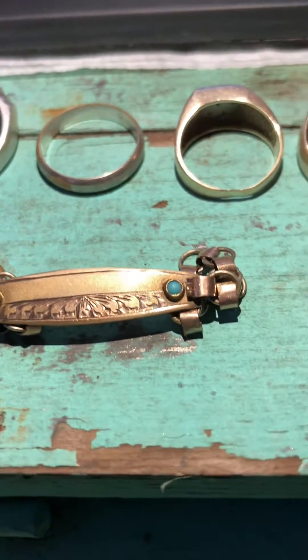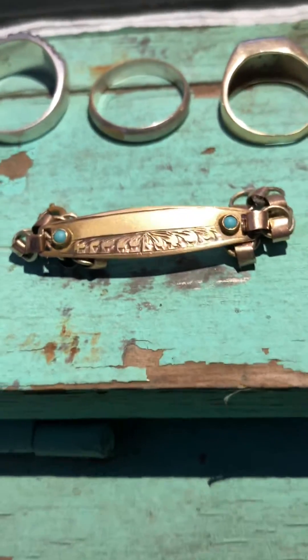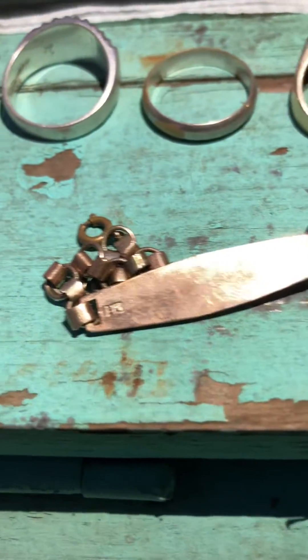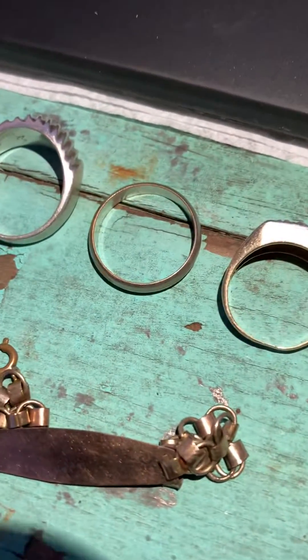We have 8 carat rose gold compared to all these other metals — this one is the outlier. It kind of stands out; it has a red color. Let me reverse this right here so we can see that it is 8 carat. Now we're going to use the acid touchstone.